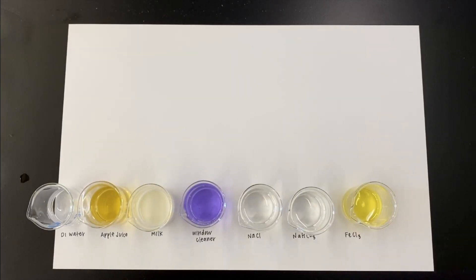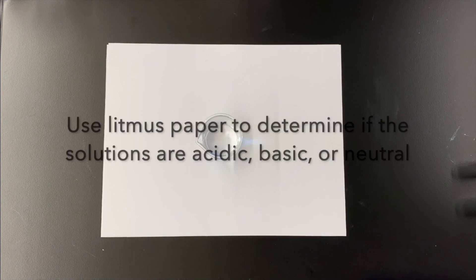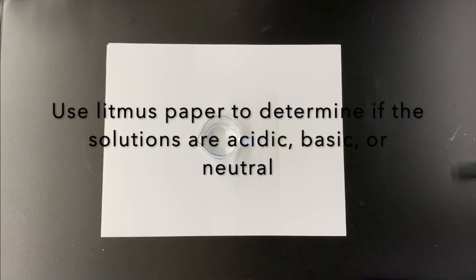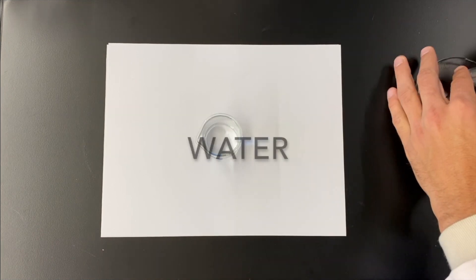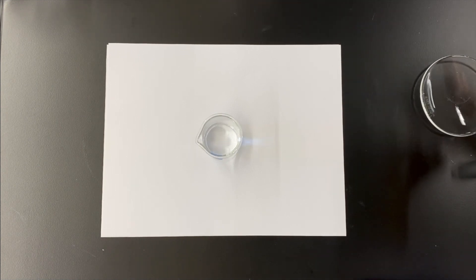This is step one of the procedure. We're getting three milliliters of each of the following solutions, and one at a time we'll be testing each solution with that red and blue litmus paper to see if it falls into the general categories of acidic or basic.